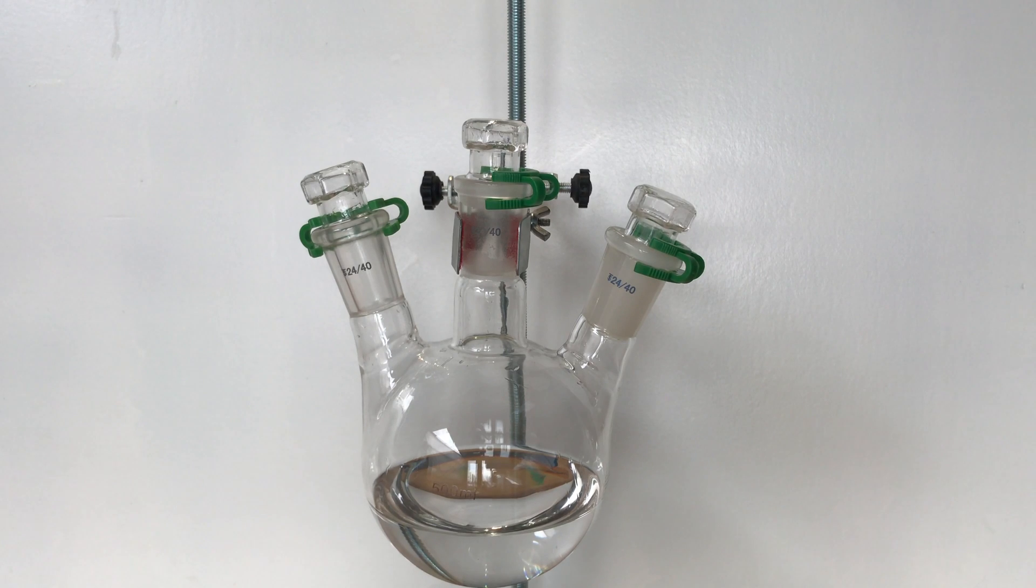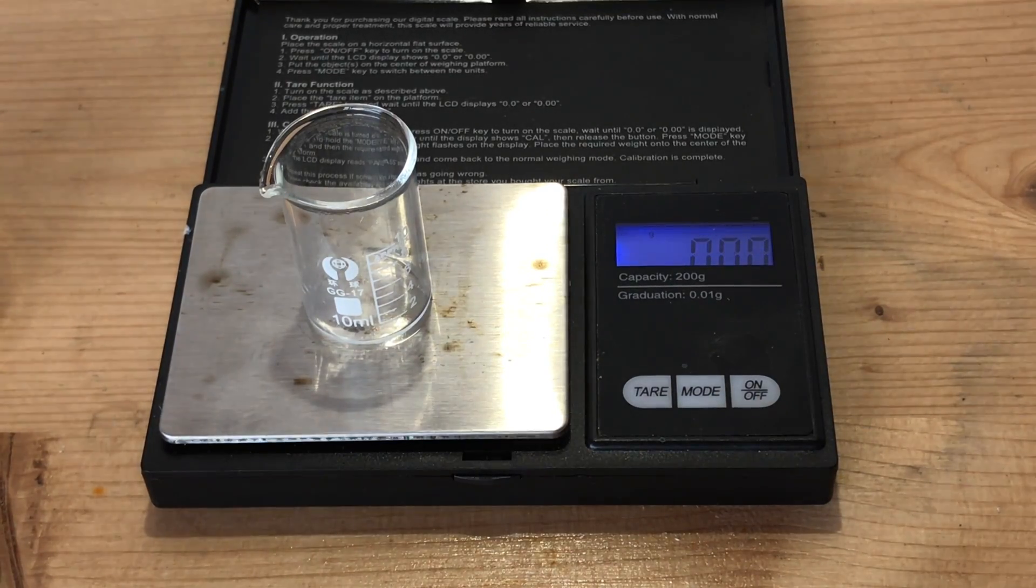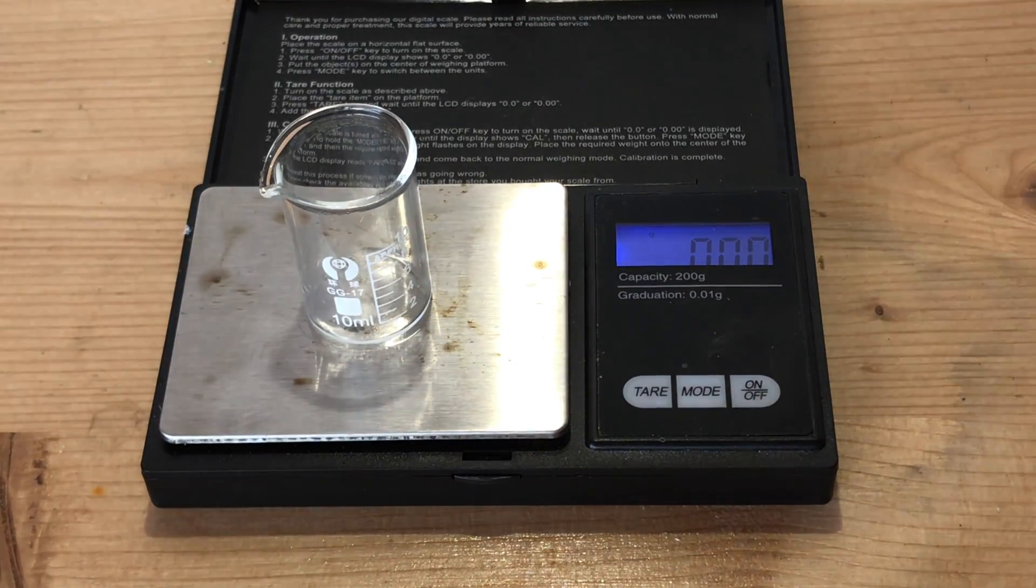After one and a half hours of work, this is the acid we've got. Now, before bottling, it is recommended to measure the density.